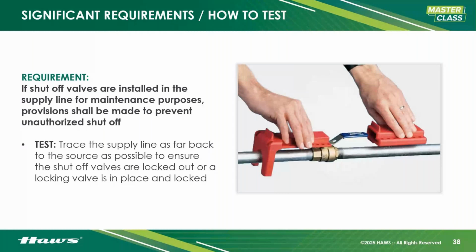I can't tell you how many pieces of equipment I've thrown on and there was zero water, only to find that the shutoff valve was in the off position.